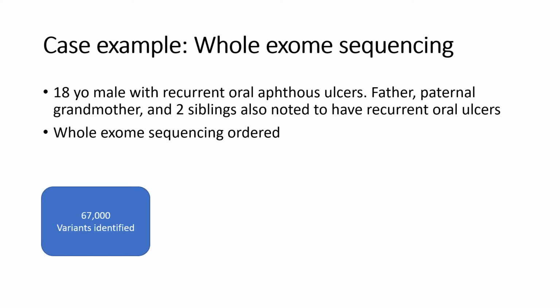So once you have a well-annotated data set, how might you go about actually filtering data from, for example, an exome sequencing case? The truth is there isn't actually great standardization in the field about how filtering is done, and filtering should be tailored to the specific goals of what you're trying to find in your case. Are you looking for novel gene discovery, or is this a clinical case, for example, where you're trying to find a diagnosis, something that's clinically actionable for a patient? So let's run through a very simplistic example to prove the point of how this might work.